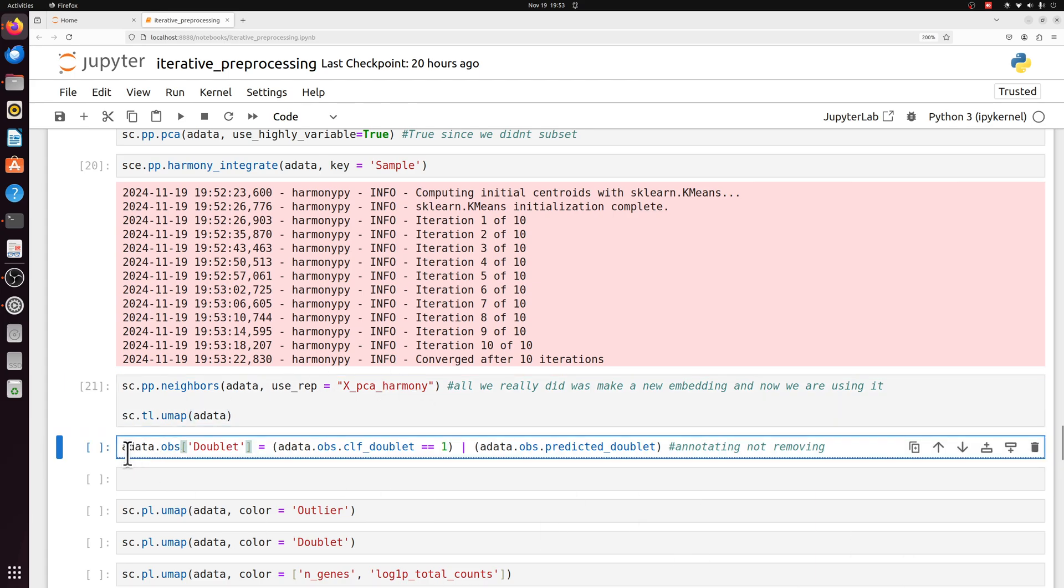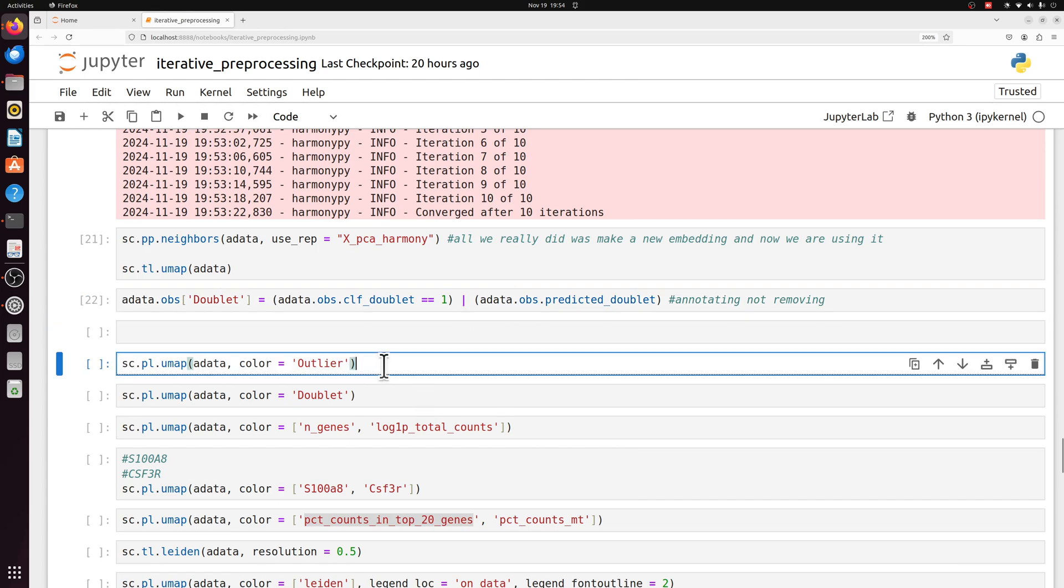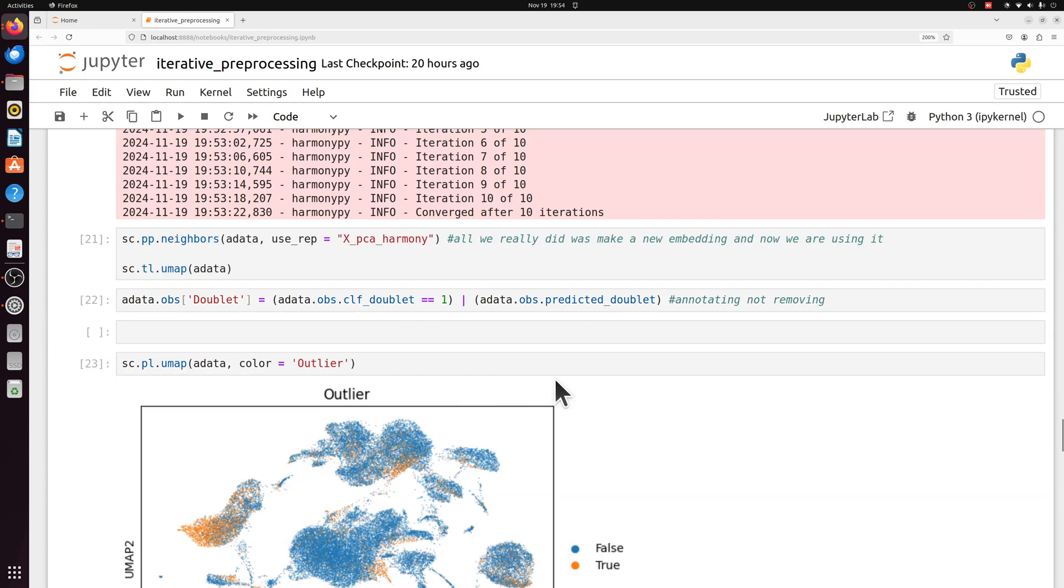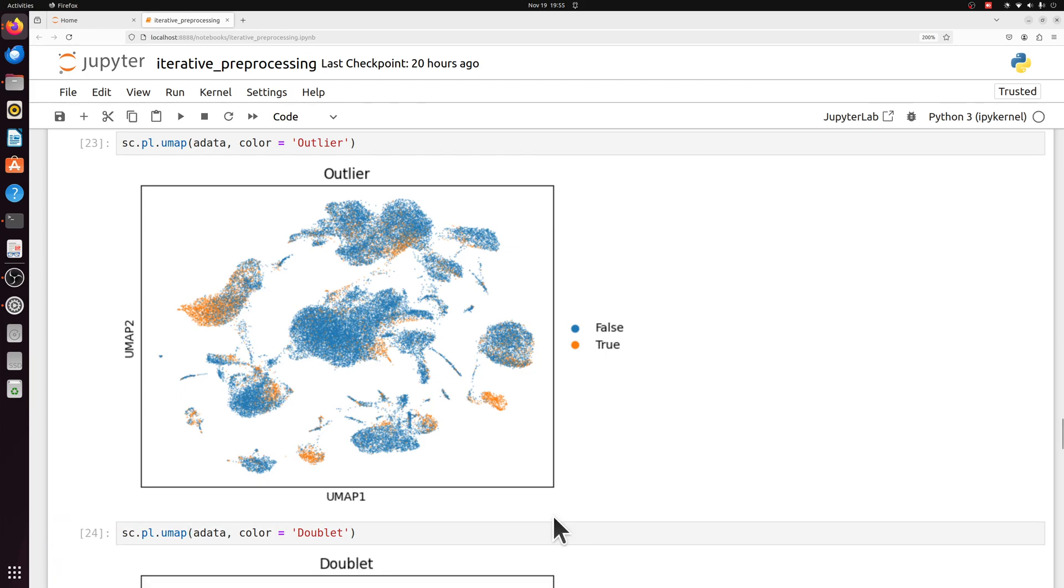And then here I'm just making a new column in the observation data frame called doublet, and it's just going to be true or false if it was labeled as a doublet from either of those two methods that I used. And then let's actually look at the outliers here. There should be one main thing that stands out here. Some of these clusters are primarily composed of outliers. And we'll get to that in a second.